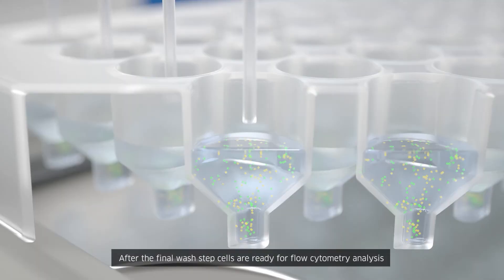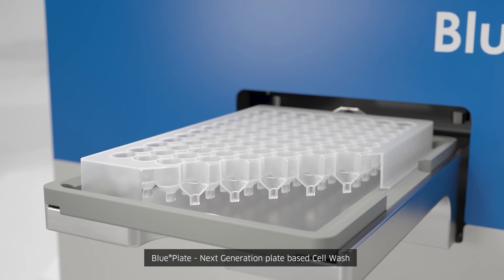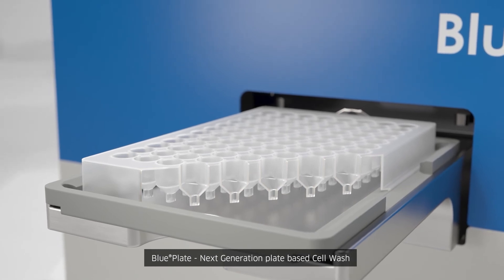After the final wash step, cells are ready for flow cytometry analysis. BluePlate — next generation plate-based cell wash.